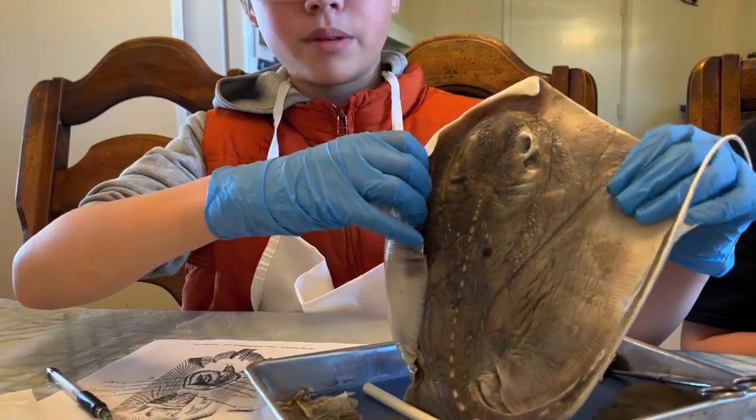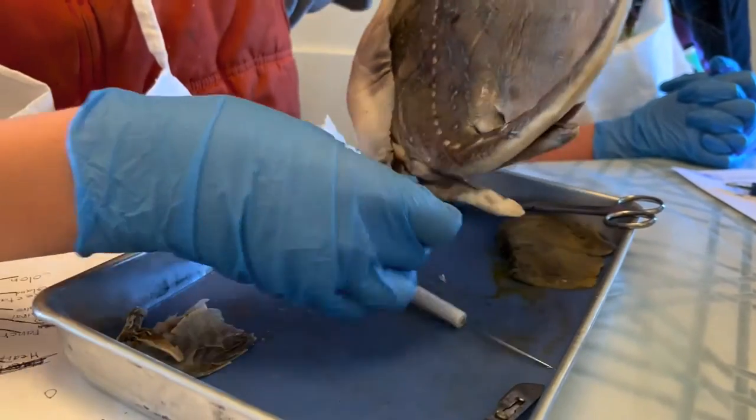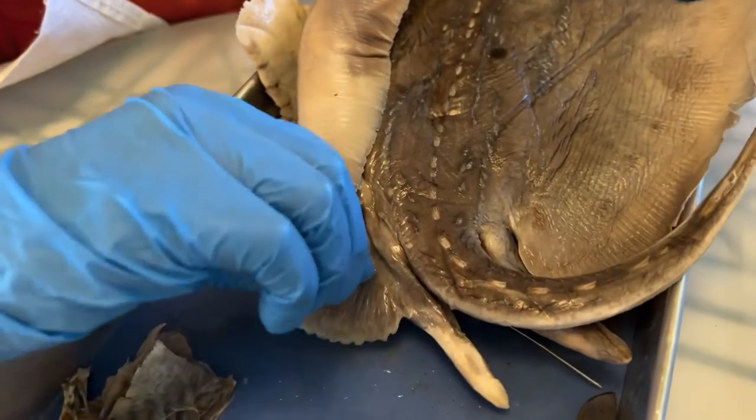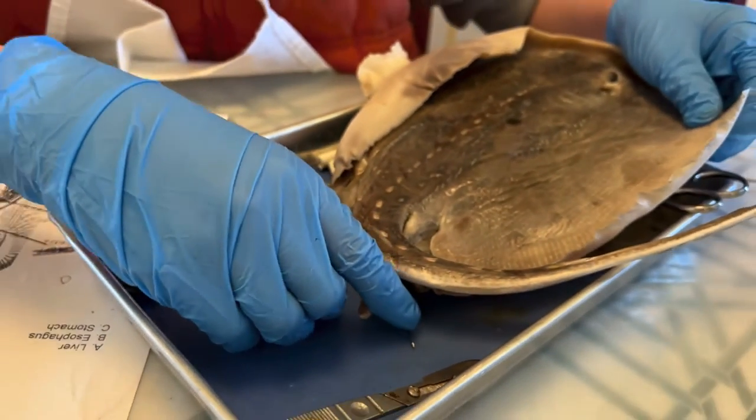These are the pectoral fins, and these are the pelvic fins — they use them to swim. And then these are the claspers, which are found more developed on males.